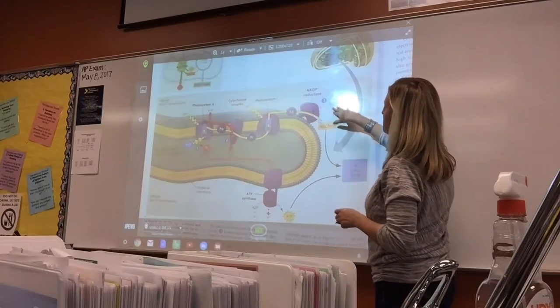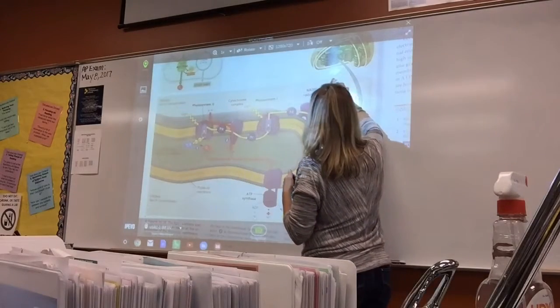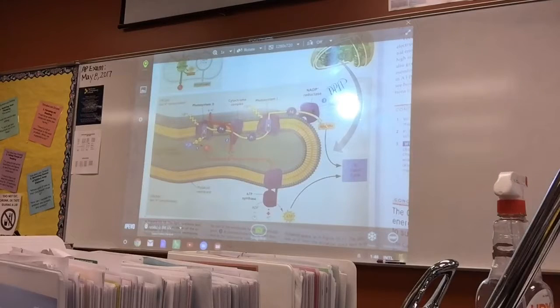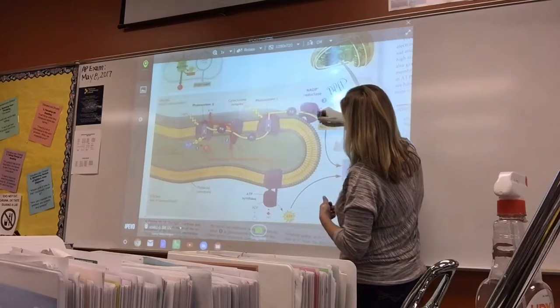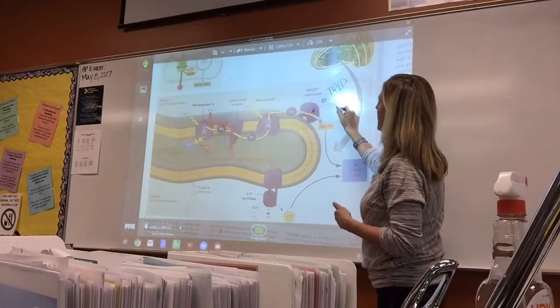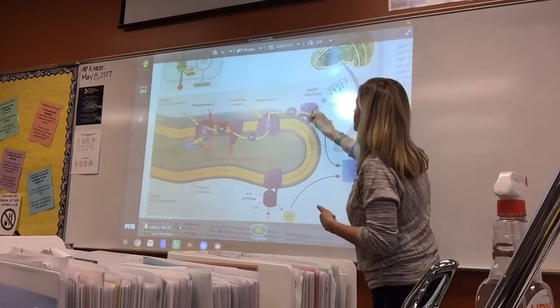So in the chloroplast, you have NADP+. In this lab, we put in here as well a chemical that's not naturally found in cells of plants, called DPIP. And instead of the electrons going in this direction and NADP+ accepting them and becoming NADPH, that doesn't happen.